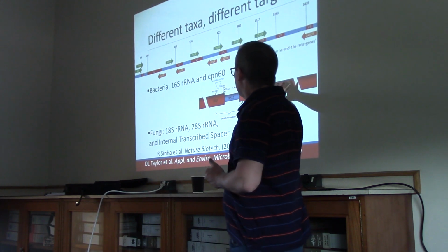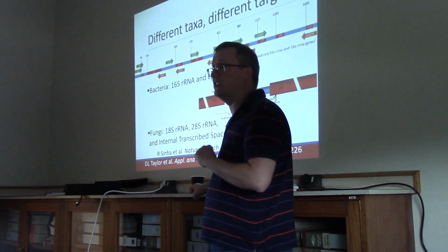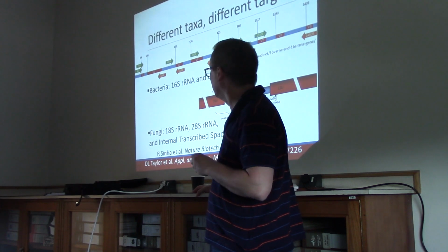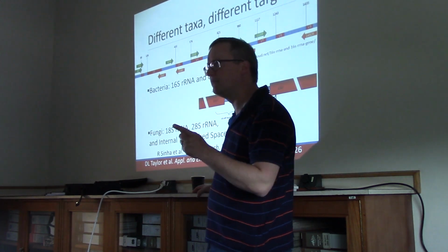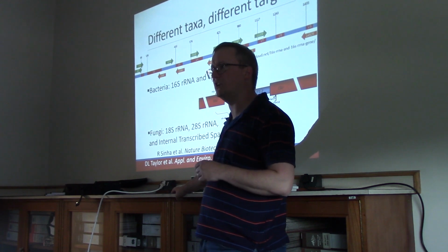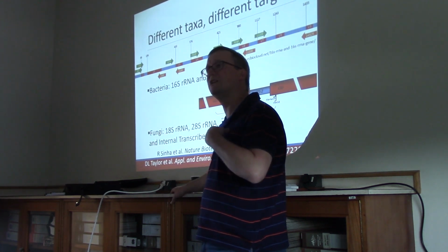Okay, now, I note that 16S rRNA is not the only thing that could be sequenced to give us this resolution. In bacteria, some folks have looked at CPN60. This is a chaperonin. Everyone knows about chaperonins? Proteins that help others to fold properly. Yeah, so the chaperonin 60 protein has a pretty good mix of constant and variable regions to help us understand which species we've got.